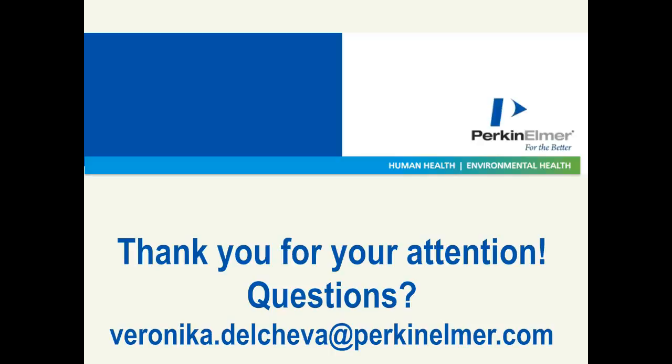Okay, thanks, Sandra. So another question that we've had, and I'll direct this one to Veronika, is from Drew Lichtenstein at Novus International. Is it possible to do blotting type experiments on the system? Unfortunately, not directly, so we can't really do immunoblotting with our system. And to answer maybe your second question, which could come, no, we can't do multiplexing with the system. We have only one laser and one source of excitation, so at this moment, this is not possible yet. Okay. Thanks, Veronika.